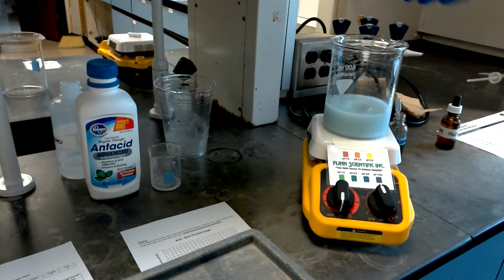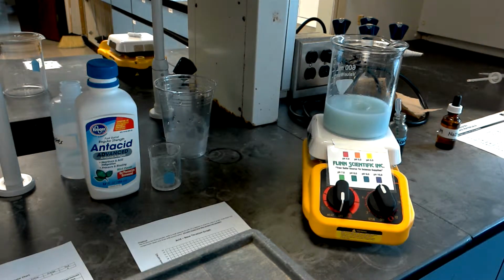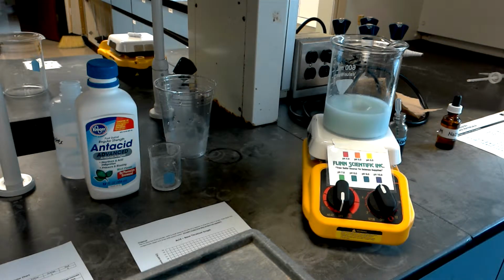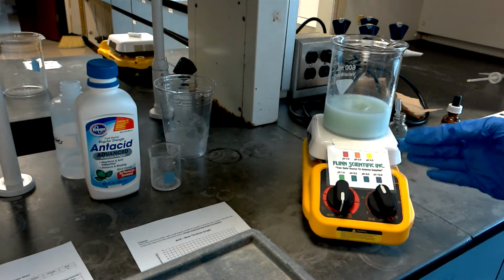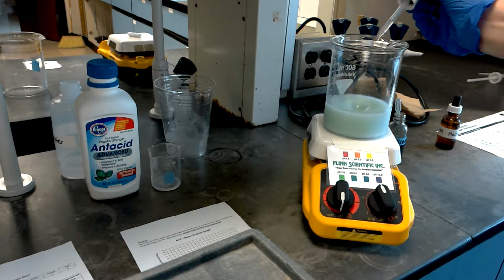It's beautiful. I don't know if you can tell that there's some pink inside there that then spreads out. Okay. 20 drops. And I think that I would probably call that almost a perfect 7. 22 drops. Now we're going below 7 because it's green, but it's got a lot of yellow in there.